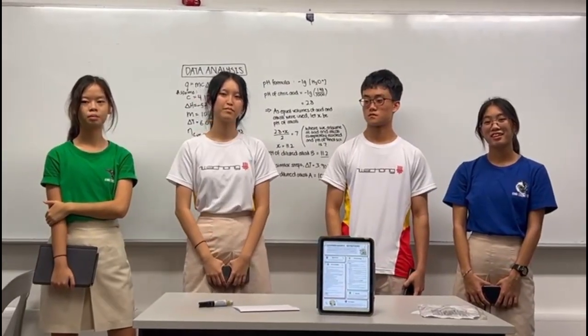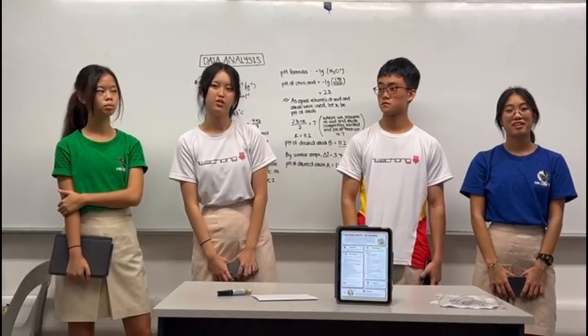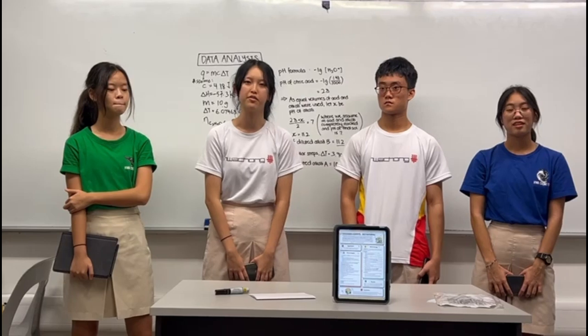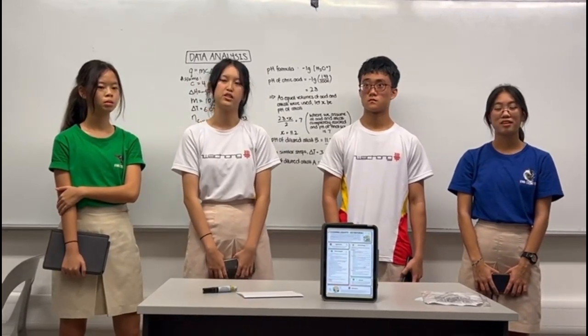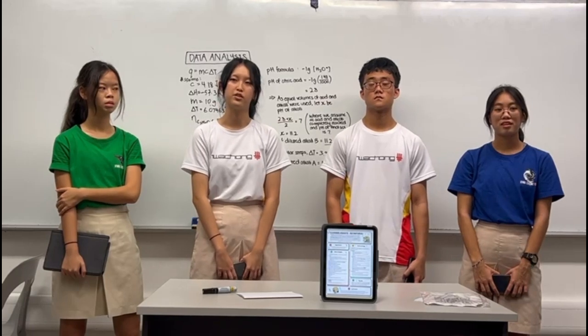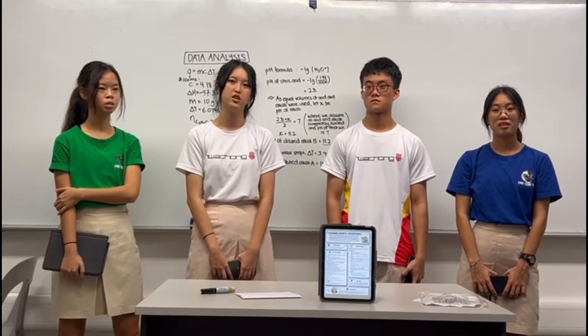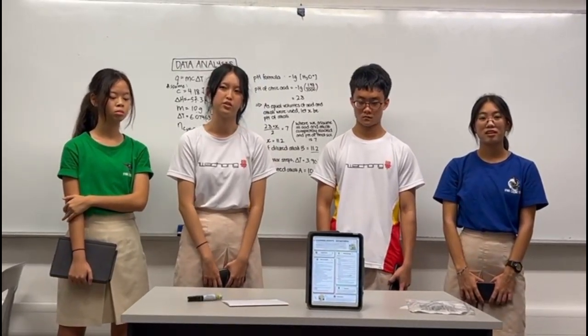What difficulties did your group face during the procedure and how could they be improved? On our first try, we used a plastic container with an open lid, and this may have caused significant heat loss in our experiment. So we switched to a styrofoam cup with an insulated lid for our second try, with a hole in the top for the microbit thermistor. This ensured that heat loss was minimized and our results were accurate.